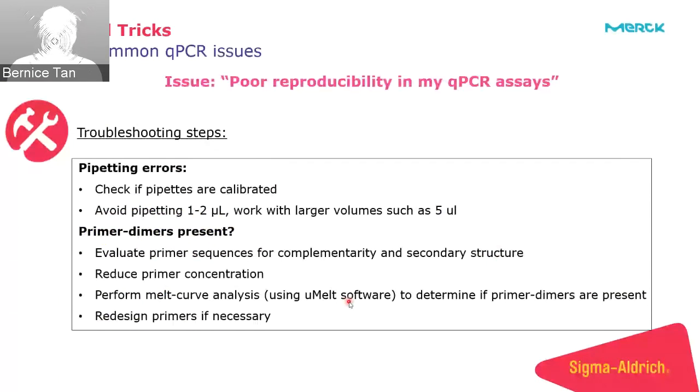And if you can't fix this, you might just want to redesign your assay and start from scratch again, and that can help as well.